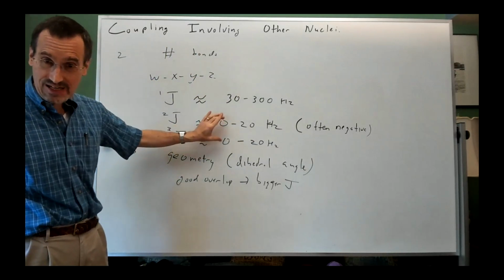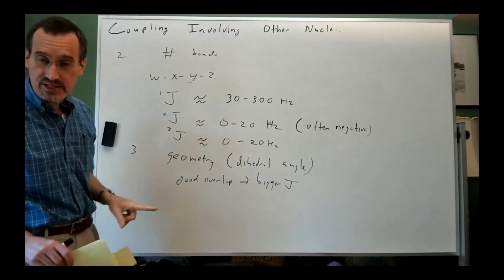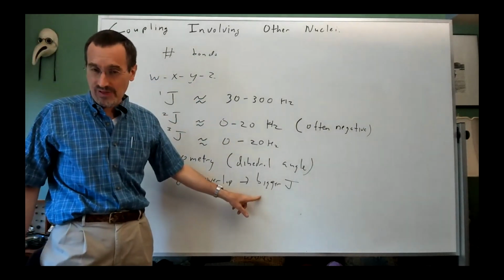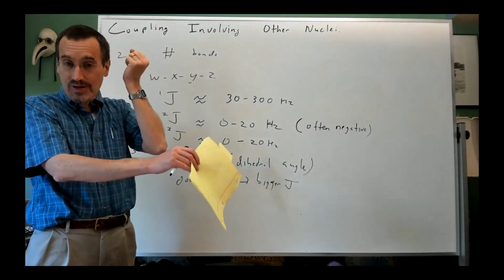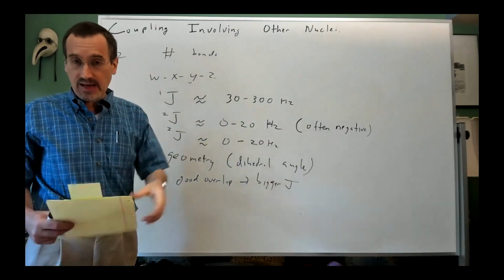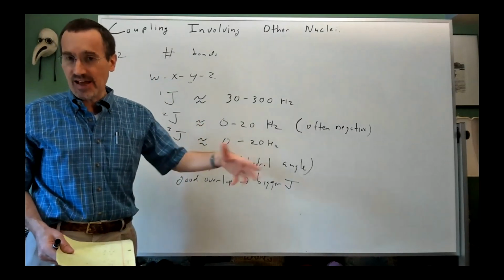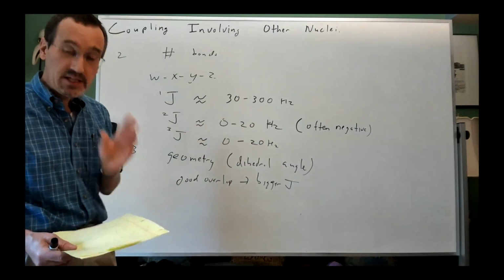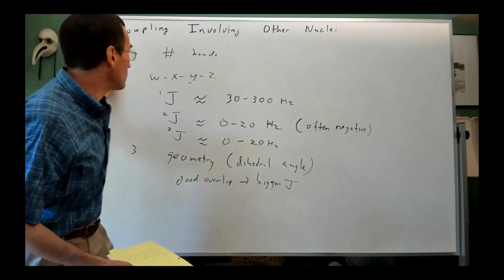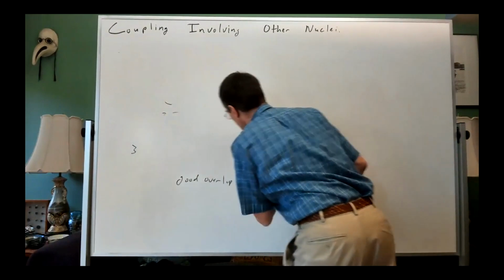So the first caveat is we won't know exactly how many bonds there are between the 2 atoms. And if you have poor overlap, meaning like a 90-degree dihedral angle on a 3 bond relationship, you may not pick up that coupling at all. It's James's favorite statement, absence of evidence is not evidence of absence. This is going to make more sense when we start to use HMBC, and we see both its power and its limitation.